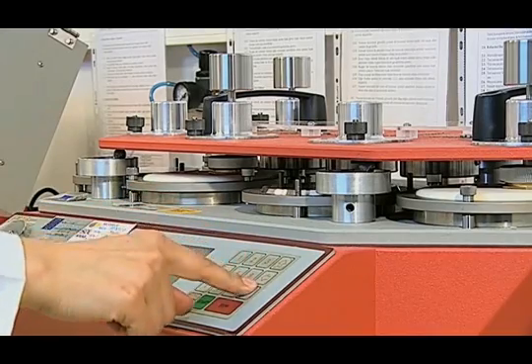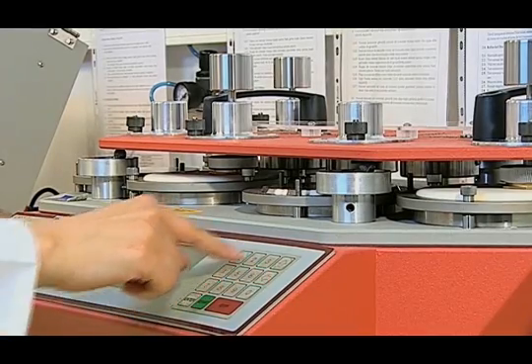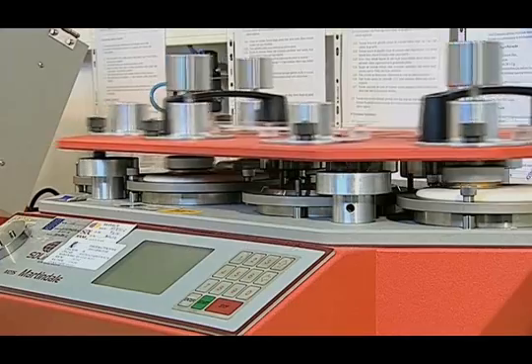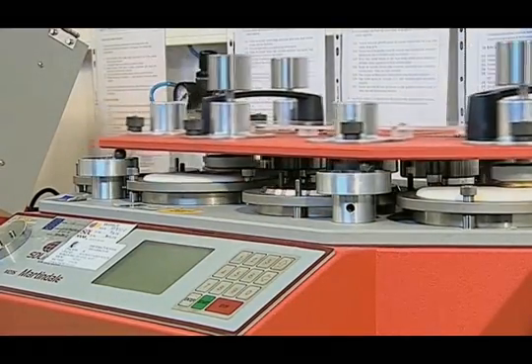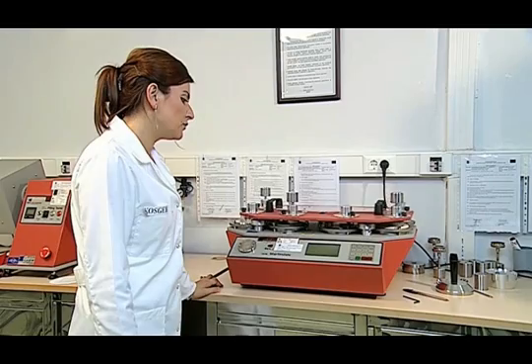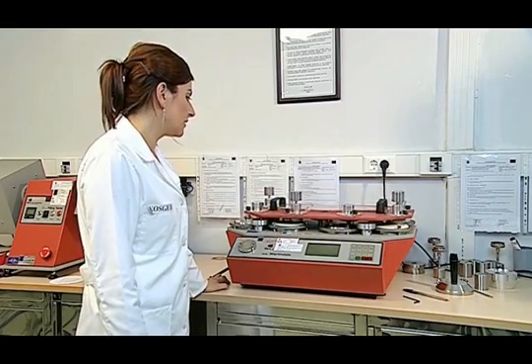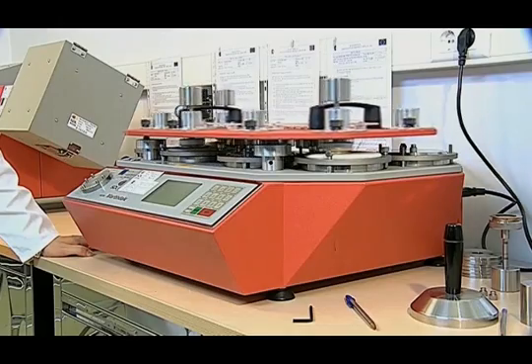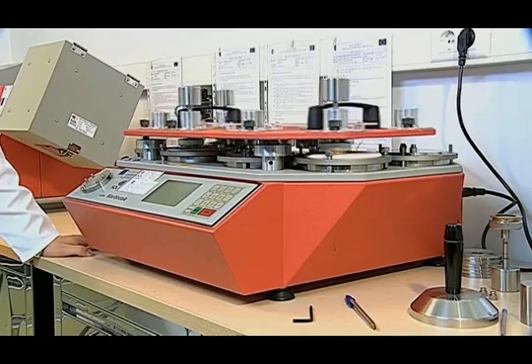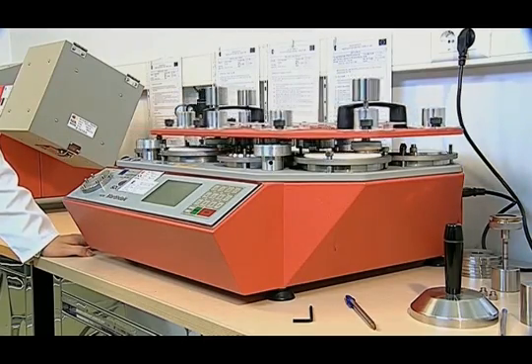To do this, we initially enter 2000 cycles and press the start button. We will check the samples at certain intervals. At the end of 2000 cycles, the device will automatically stop. We use an 8x magnifying glass or loupe to check for breaks. When there are two different weft or warp yarn breaks, we end the test. If there is no abrasion when we check it, we enter 2000 cycles again and continue the abrasive friction.